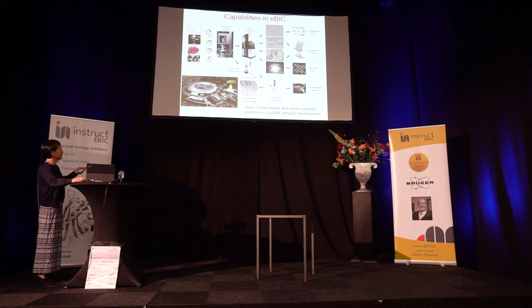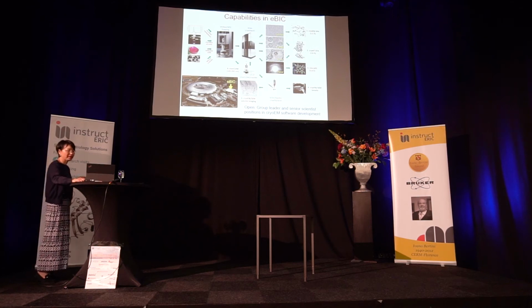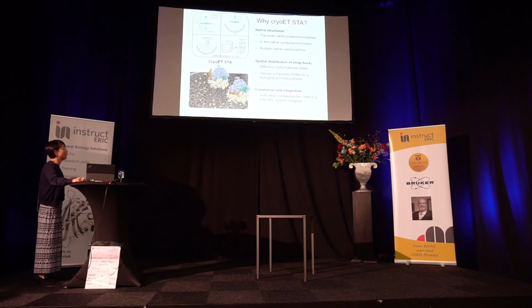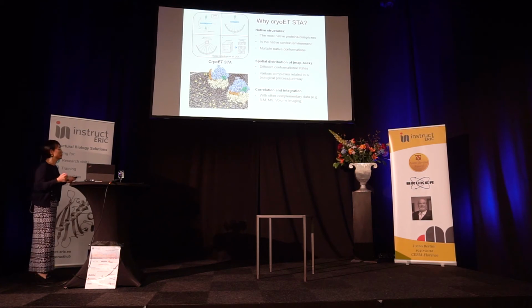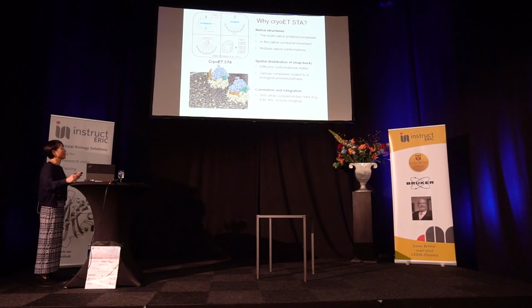We do a lot of single particle and microED, and today I would like to focus on cryo-electron tomography and subtomogram averaging. Yesterday, Julia explained a little about cryo-electron tomography and subtomogram averaging. This is very useful for in situ structure determination, because we can study proteins and complexes in their native environment, and also multiple different conformations within the native cell during cellular processes.